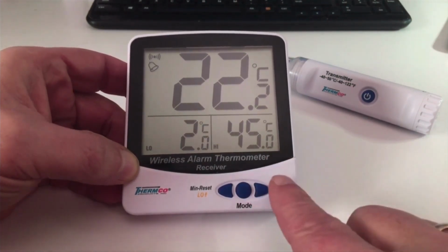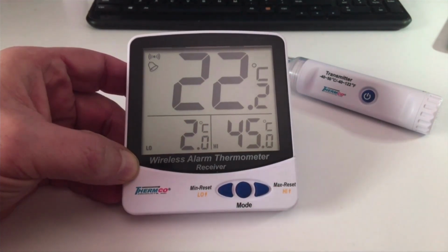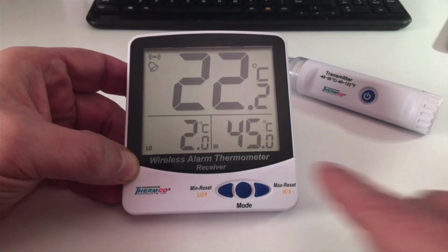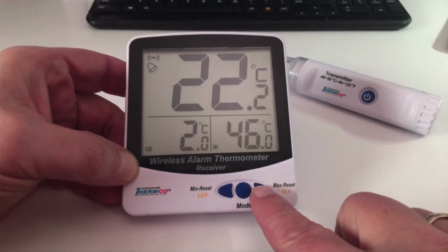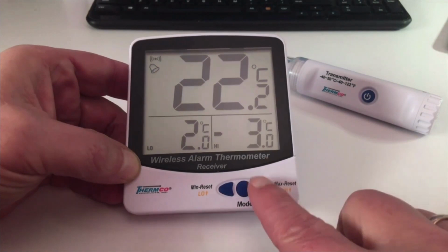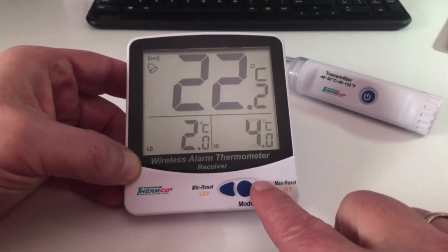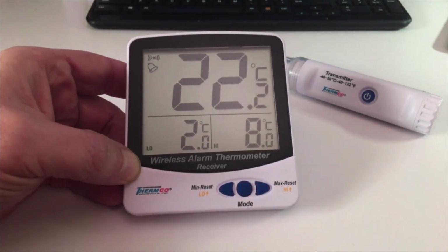So I am past 8 degrees, so I hold this button until it goes up to the maximum value and it will loop back around. I'll go up and around 70 degrees C, it will drop to minus 40. Now we're climbing back up. And when I get close, I start doing single presses to get to the temperature. Okay, 2 and 8 degrees C.